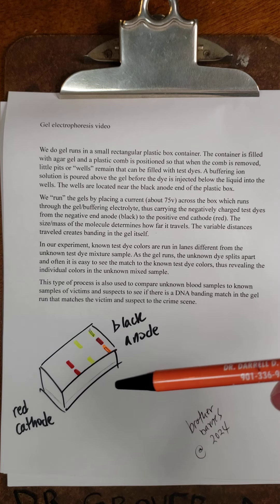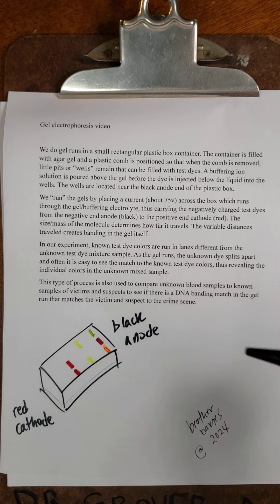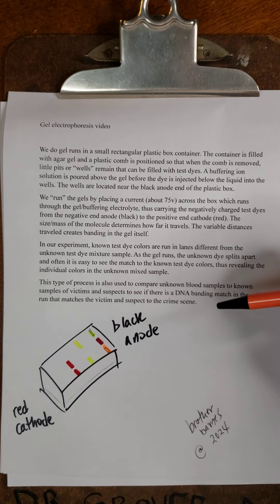This type of process is also used to compare unknown blood samples to known samples of victims and suspects to see if there is a DNA banding match in the gel run that matches the victim and suspect to the crime scene.